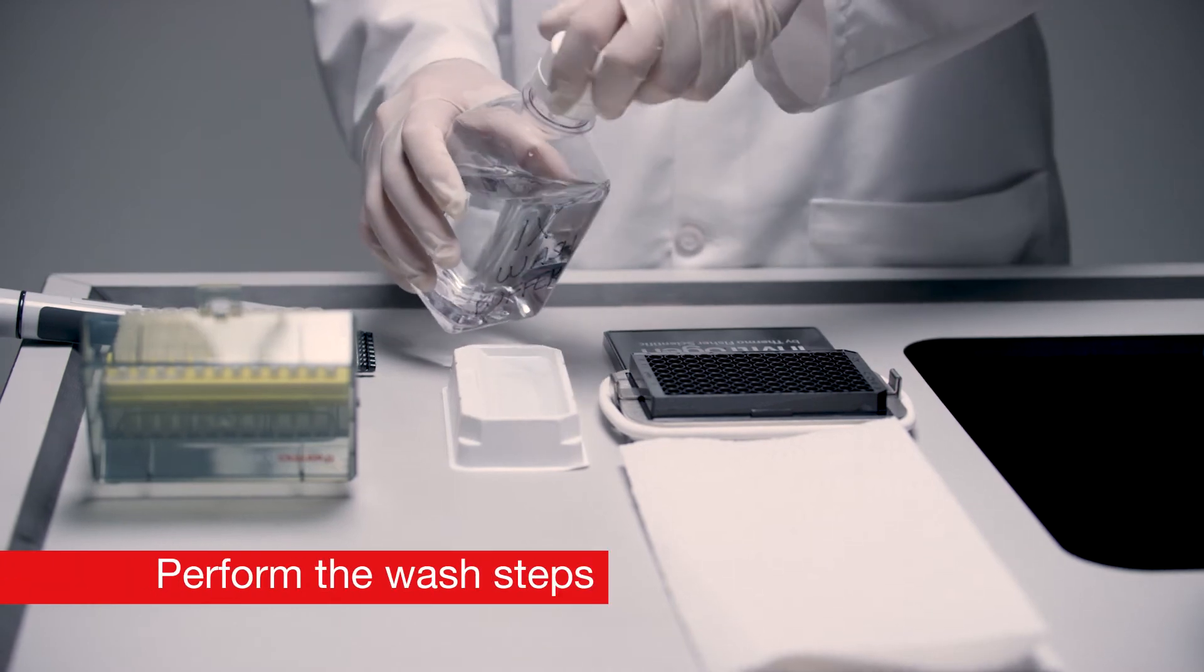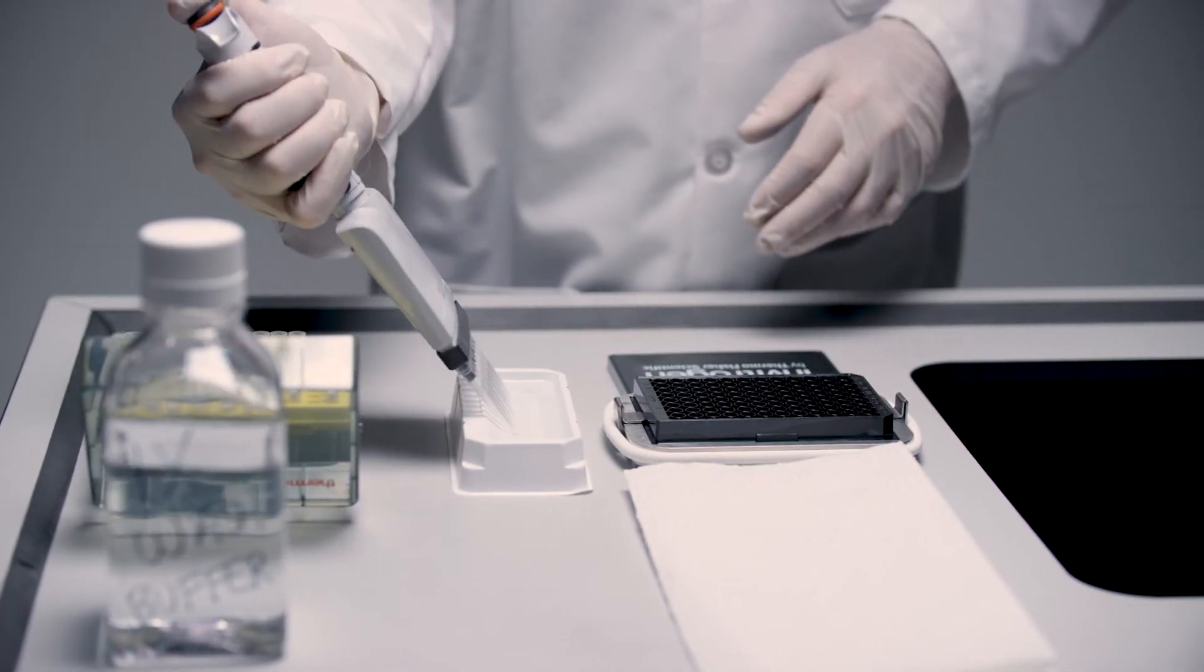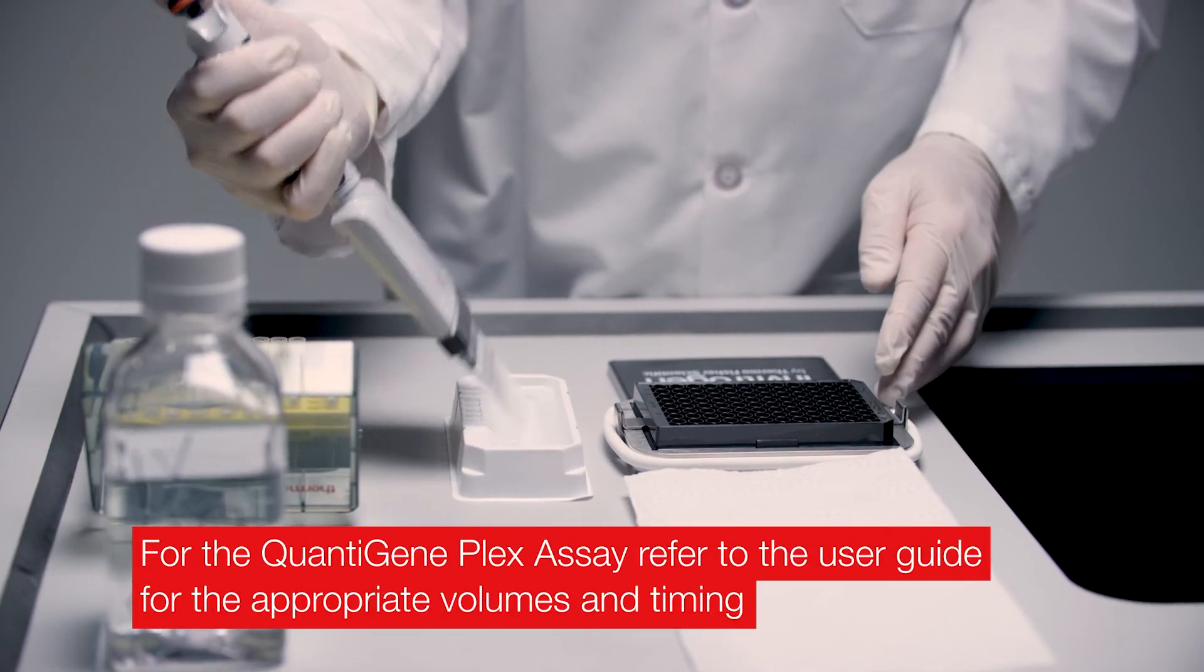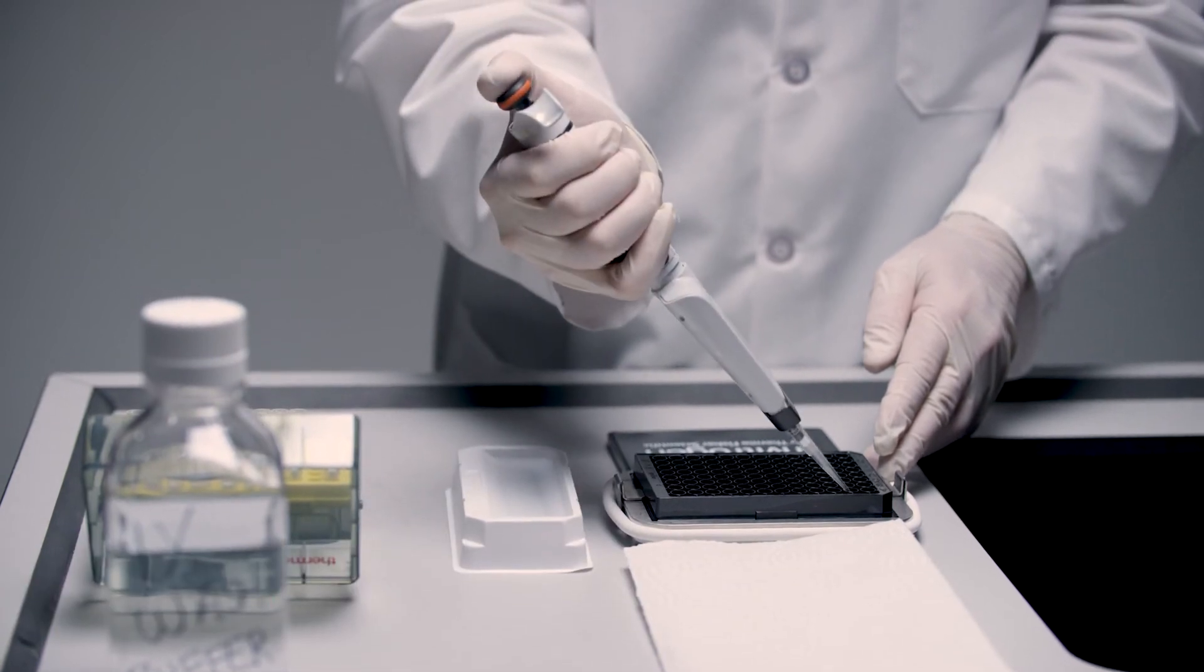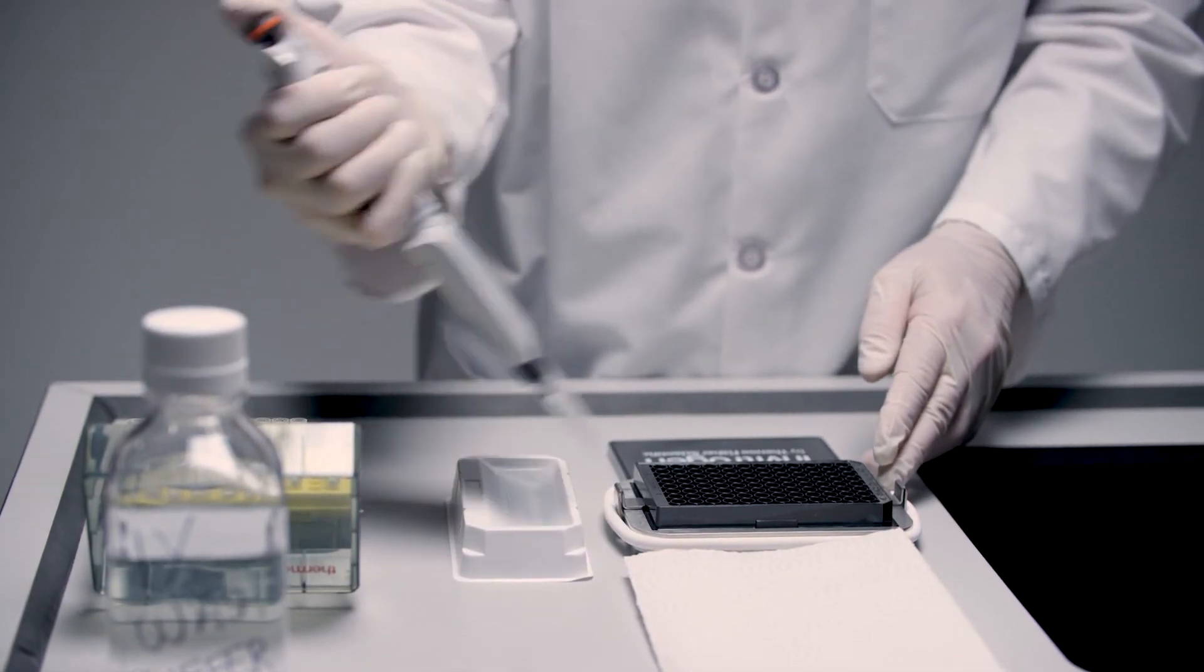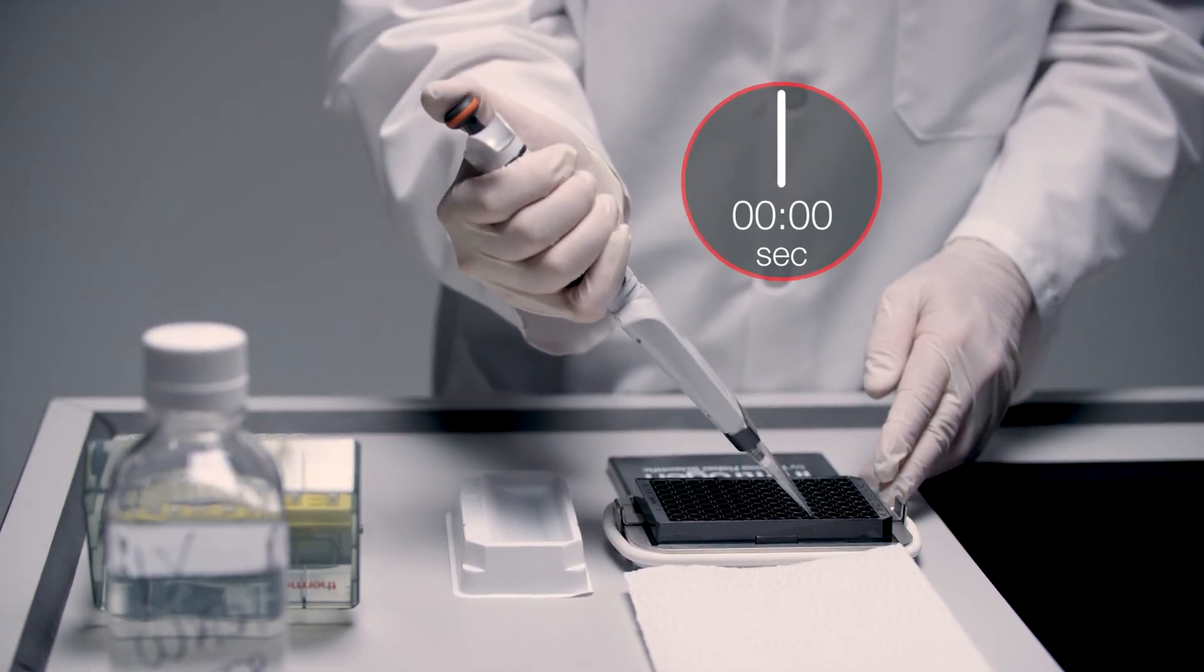To begin the wash step, pipette 150 microliters of 1x wash buffer from a clean reservoir into each well using a multichannel pipette and allow the beads to settle for 30 seconds. Do not remove the plate from the handheld magnetic plate washer during the wash steps.